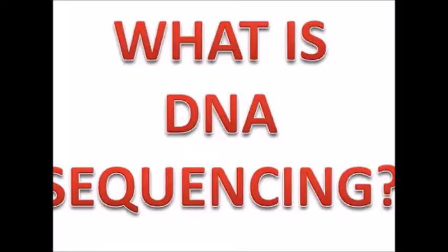DNA sequencing is a method used to determine the nucleotide bases A, T, C, and G of DNA. Every organism on planet Earth possesses a complete genetic material. The genetic material contains the full genetic information about the organism. DNA sequencing allows scientists to use the genetic information for different purposes such as medical research and forensics. Certain biological processes also take place because of the genetic information obtained from DNA sequencing.